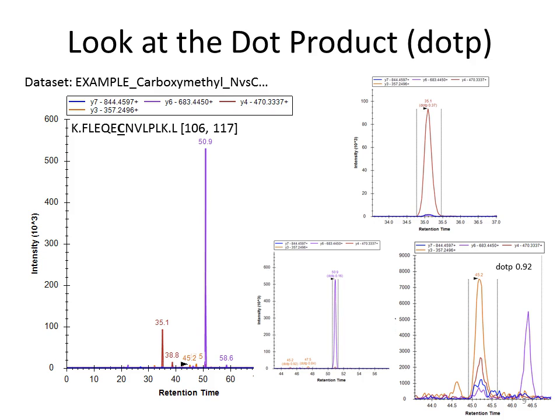So when I import my triple quad data, let's just say I made a rudimentary list with a lot of potential product ions. This one has 1, 2, 3, 4 for this peptide, the FLEQ. This is the chromatogram that was imported, and Skyline's picking this guy at 45.2 minutes. And I'm like, why would you pick that? There's this big peak right here, and this other big peak.